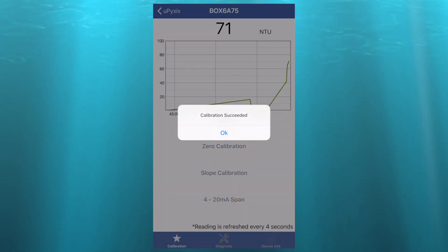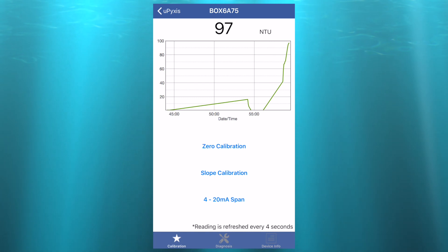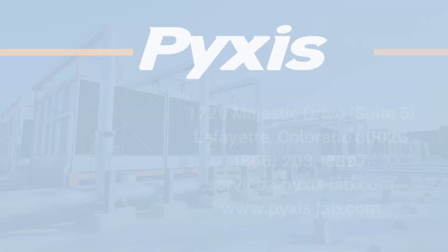A calibration success message will appear, and the readings chart will begin to read near 100. The Pixis ST730 inline turbidity sensor is now clean and calibrated.